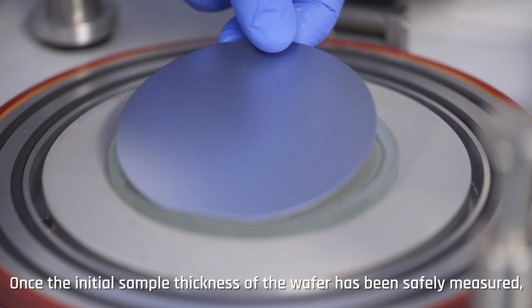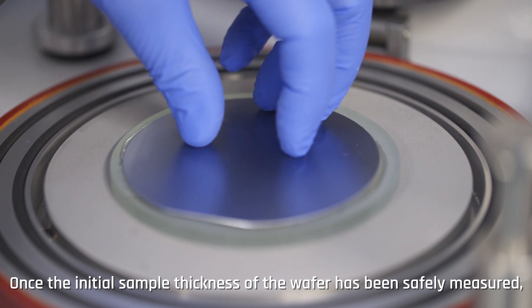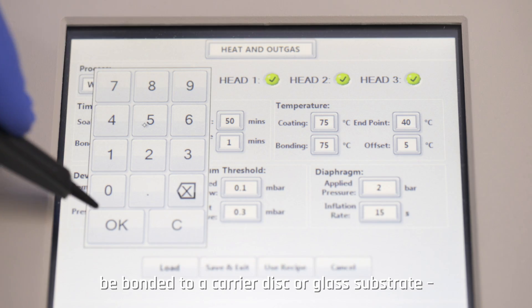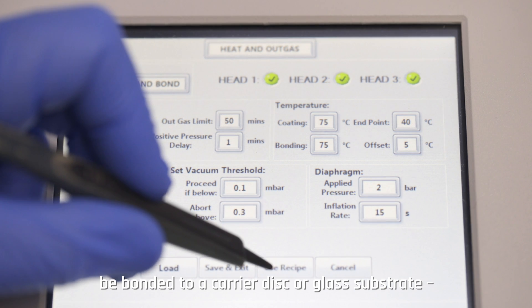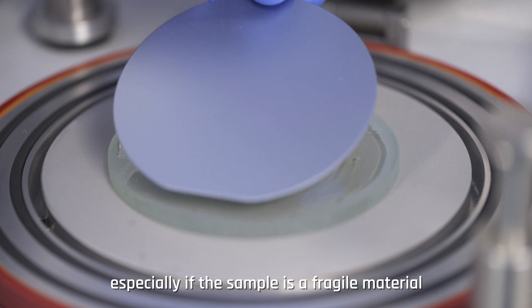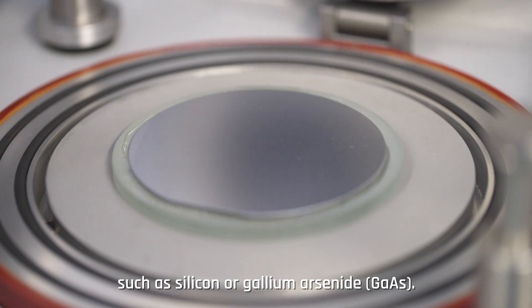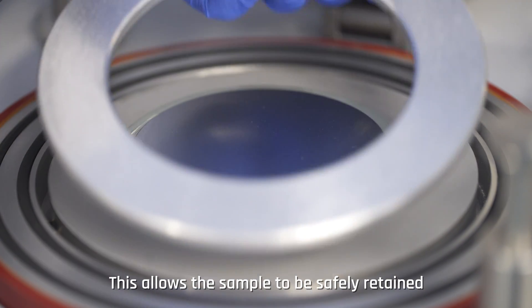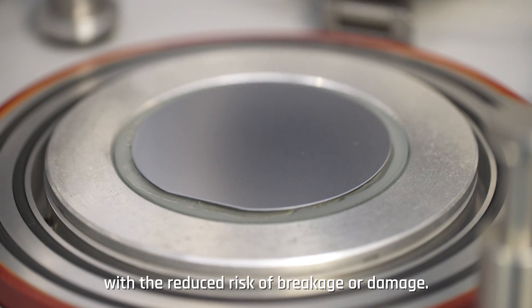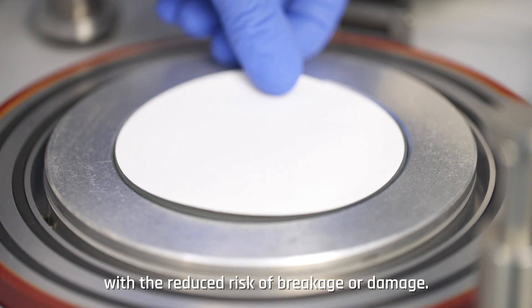Once the initial sample thickness of the wafer has been safely measured, it is then important that the sample be bonded to a carrier disc or glass substrate, especially if the sample is a fragile material such as silicon or gallium arsenide. This allows the sample to be safely retained throughout the lapping and polishing processes with the reduced risk of breakage or damage.